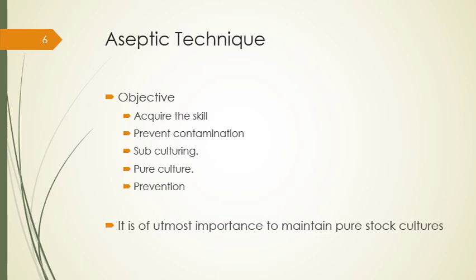Proper aseptic technique prevents contamination of cultures from foreign bacteria inherent in the environment — for example, airborne microorganisms including fungi, microbes picked up from the researcher's body, the lab bench top, or other surfaces, microbes found in dust, as well as microbes found on unsterilized glassware and equipment. These may potentially contaminate cultures by interfering with lab results. Use of proper aseptic technique can greatly minimize or even eliminate the risk of contamination.